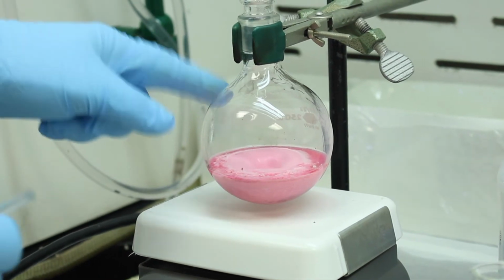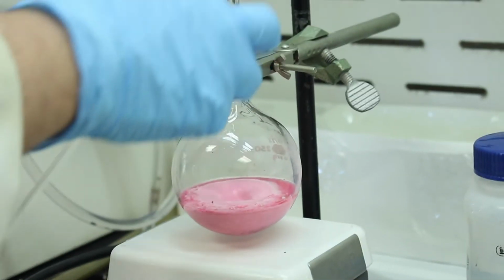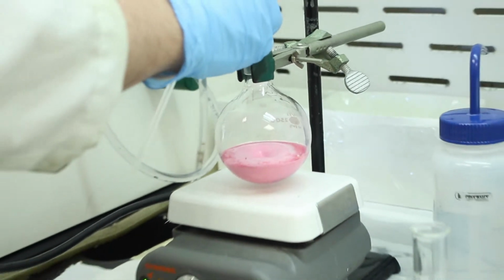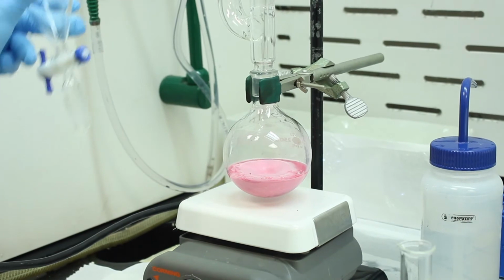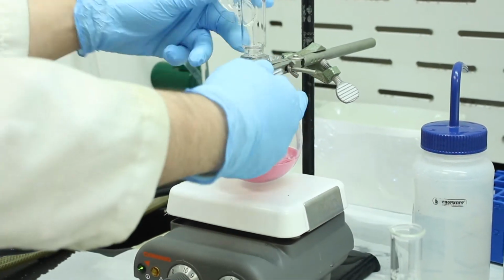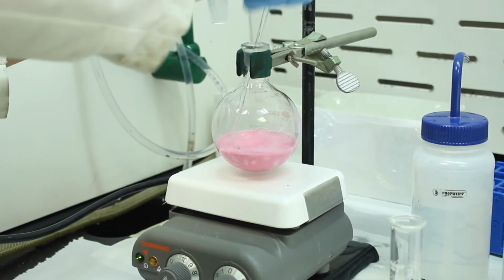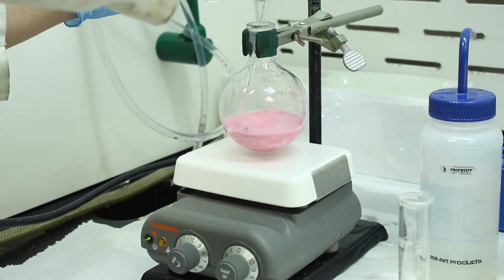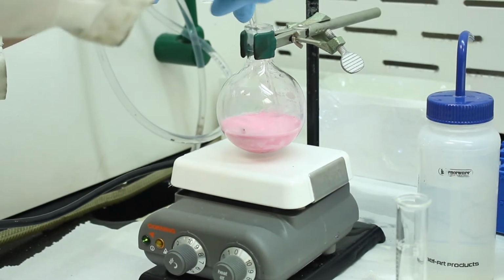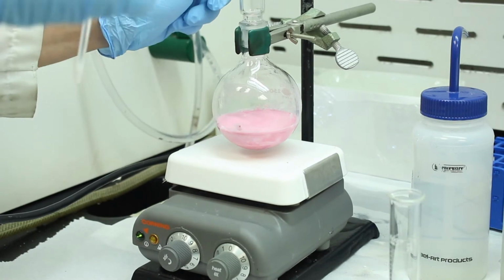Okay, so I think what I'll do is scrape down the sides with a stir rod. A little challenging. Make sure everything is integrated. There we go. There's no pockets of unreacted benzophenone. Okay, nice.